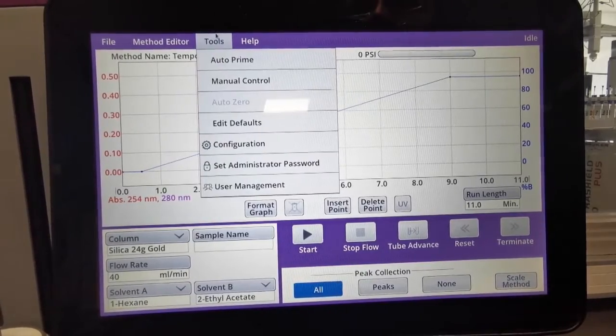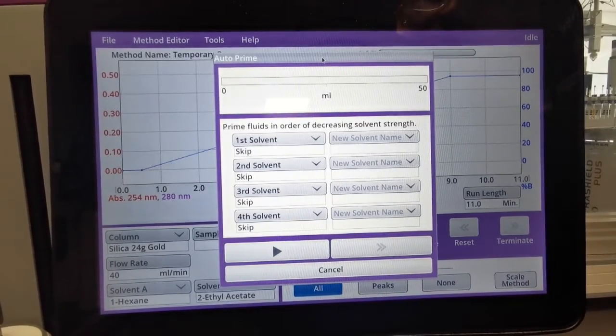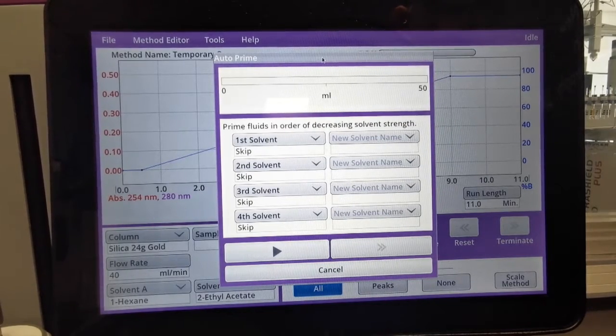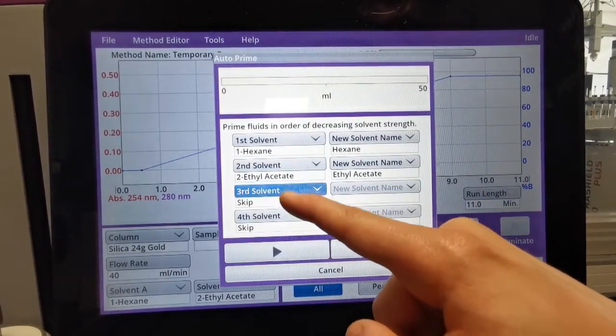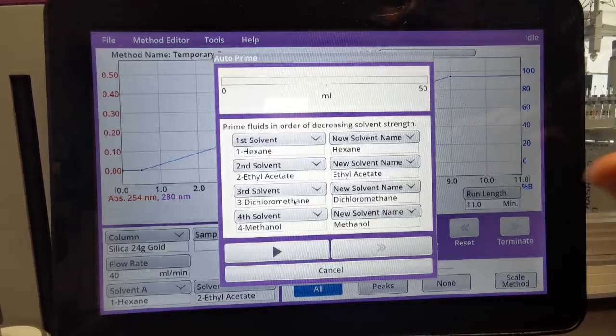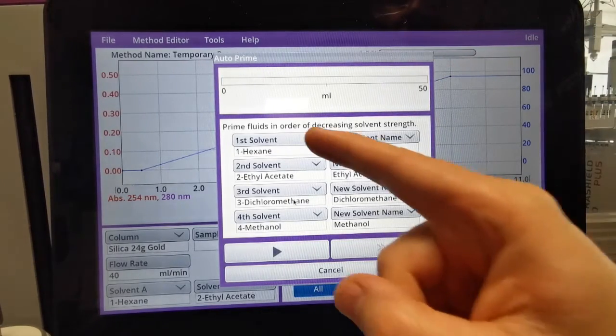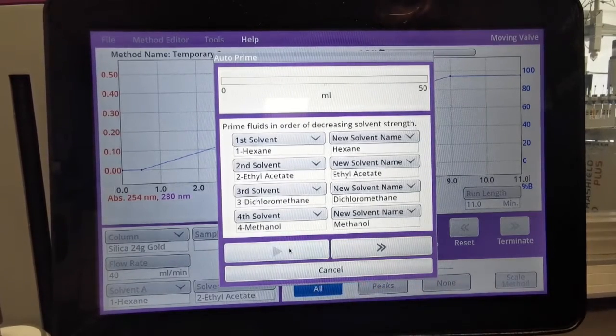To access the Auto Prime, we click on Tools and as you can see we have the Auto Prime at the top. What it's asking us to do is prime the fluids in order of decreasing solvent strength. However, we're wanting to prime the lines and the pumps with IPA. So what we need to do is insert all four solvent lines into a Winchester of IPA and then simply make sure in this table that all four solvent lines are selected. As we're using IPA, it doesn't matter what the solvent names are as long as all four individual lines are selected. We then press play and the system will prime each solvent line with 50ml of the solvent.